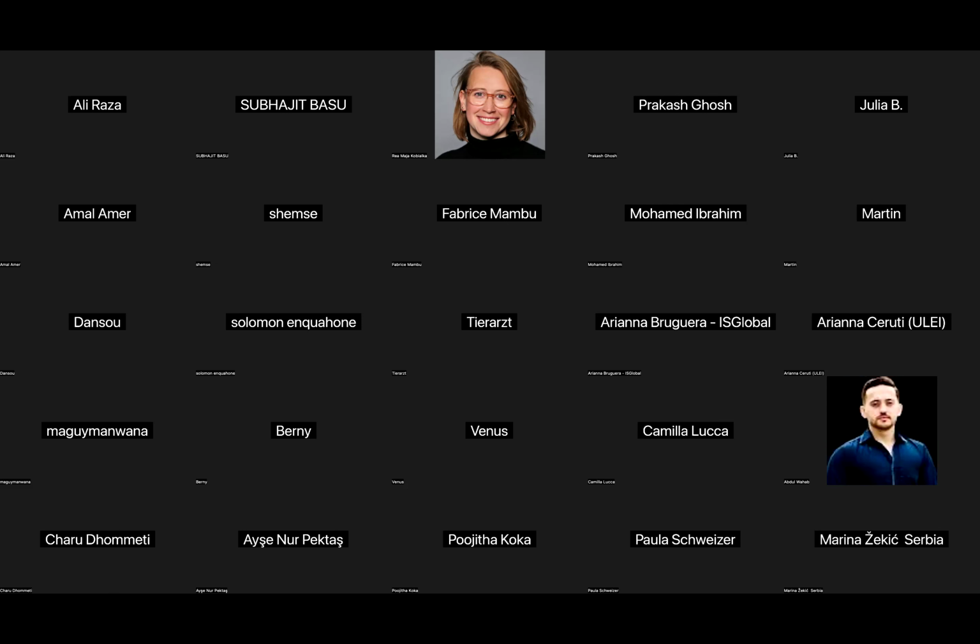No, in EPI2ME there are default models. For base calling, there are 3 models you can select: one is fast, one is high accuracy, and another is super high accuracy. So you can select as you wish. If you would like to detect a pathogen in an outbreak situation, you have to go for the fast one because you need the result very fast. But if you would like to do annotations or functional genomic analysis, you have to go for the high accuracy model. You have this system already in the nanopore software, so you don't need another one.